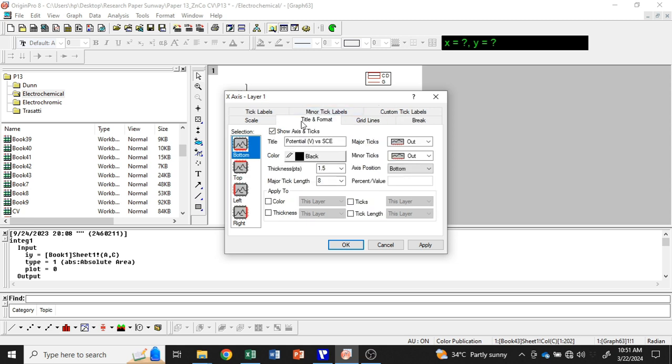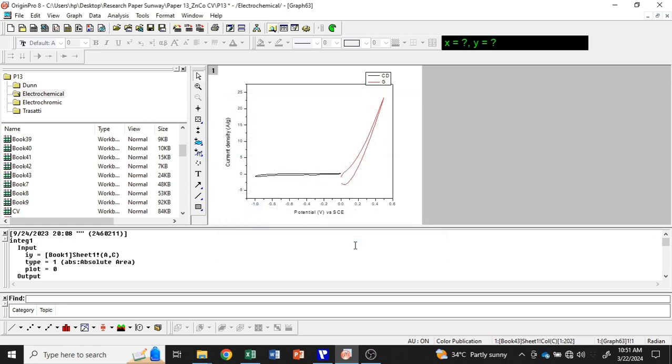We're going to change the top axis. Here we choose non-axis, but we want a solid line. Same goes to here, and on the right-hand side we also want to show the axis as none. Then click OK. After that, you already have your graph.